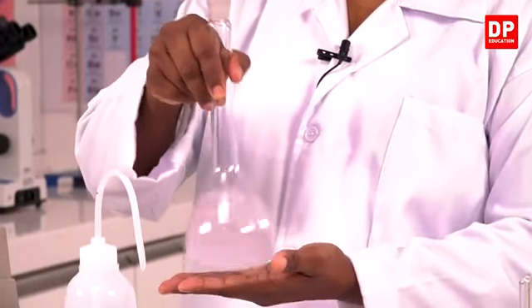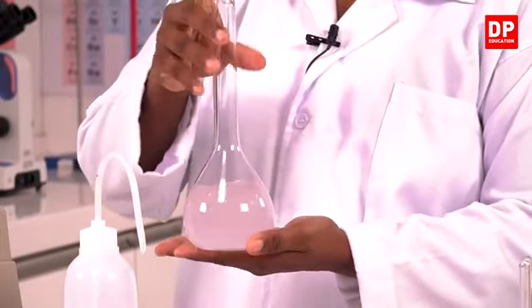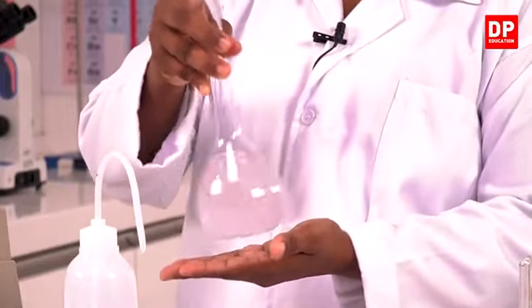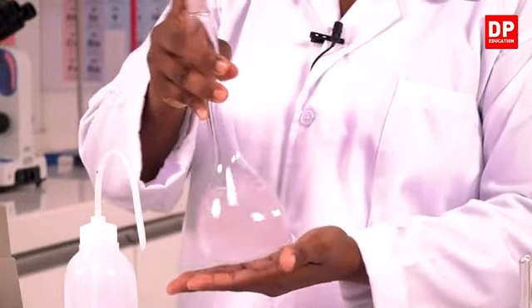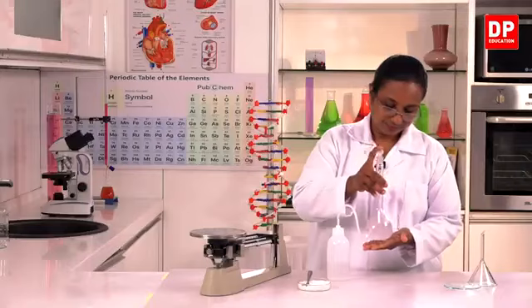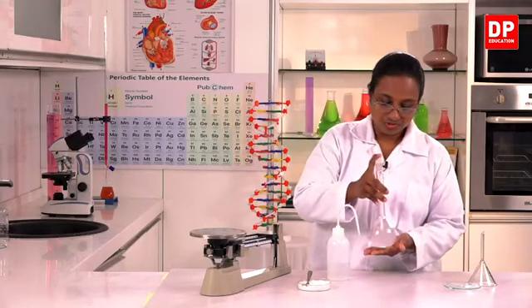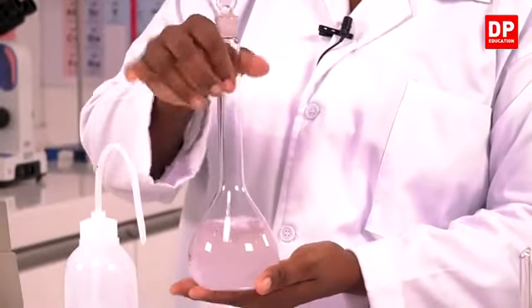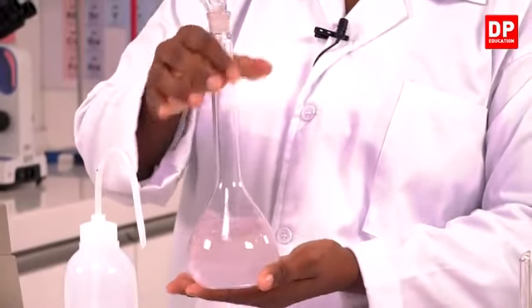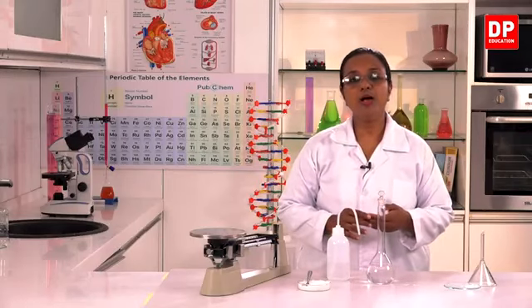So here you can see the solute dissolving. If we keep on swirling it like that, the solute will dissolve completely. I think all the solute is almost dissolved now, so that the solute is completely dissolved. Now I will make the volume up to the volume mark.